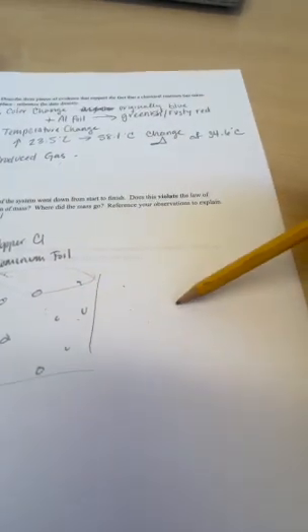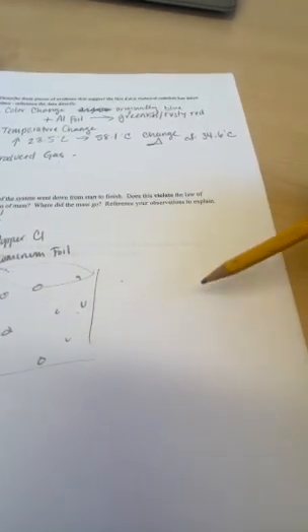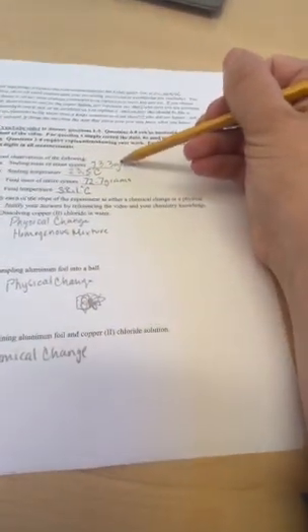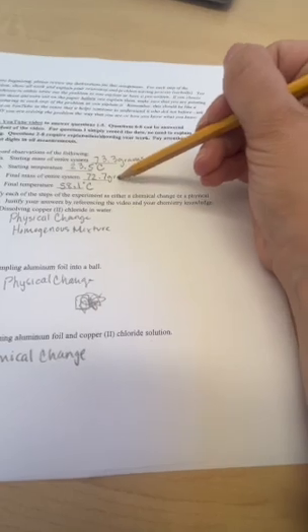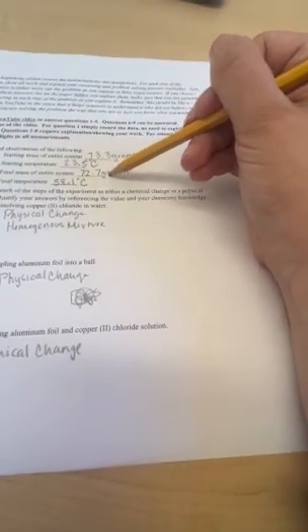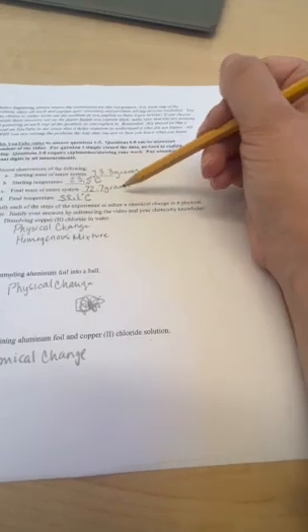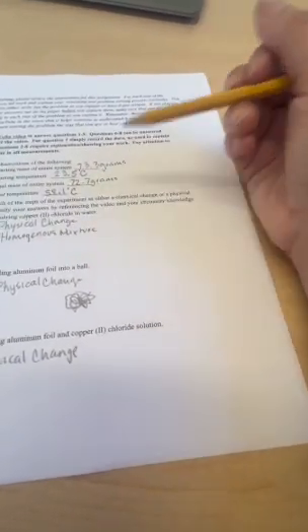The weight of everything that's within that box is still going to come out to our starting 73.3 grams. This final mass, we have that loss of 0.6 because things have evaporated, they've left that container. So now that they're out in the air, we can't weigh them. They're not still in the same place. Hope that makes some sense.